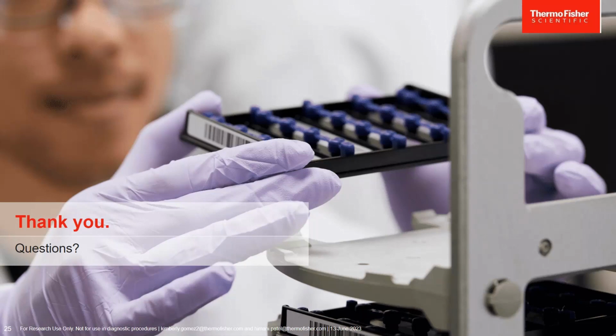Thank you. And it looks like we have time for one more question. What are the main advantages of using digital PCR in gene therapy research? A lot of the main advantage for digital PCR would be not having to use a standard curve. It's still complementary to existing qPCR workflows, but dPCR does provide high precision and absolute quantification, again, without the need for a standard curve. And as I hinted earlier in the webinar, there's the ability to look at single molecules with dPCR. So when you're doing a multiplex assay, you can look at a single DNA strand, maybe a gene of interest compared to ITR, and then look at the integrity of that molecule.